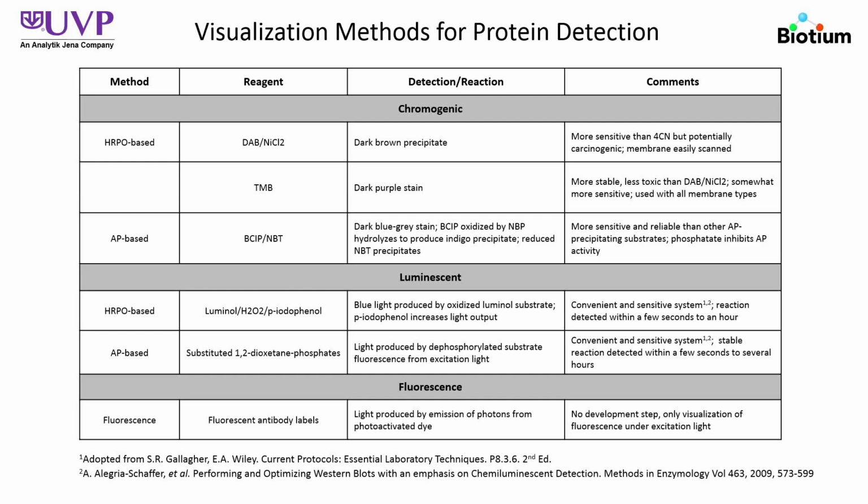Now for HRP, it's typically a luminol-based technique, and once the blot has been developed with the horseradish peroxidase tag, the luminol reagent is added, and a blue light is produced that can be captured by a CCD digital imager. As I mentioned, film is also used, but film has a number of limitations, which I'll outline later in the talk.